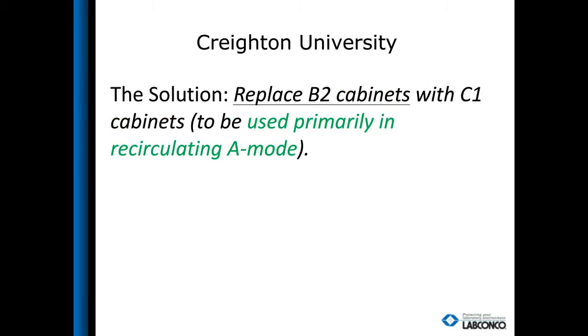So that group started by looking at LED lighting. They replaced all of their tube fluorescents with LED. They added control valves for chilled water beams and for chilled water usage within laboratories. And then they looked at the B2 biosafety cabinets. B2s get a pretty hard rap. I wouldn't say it's a bad rap, but a hard one, because they have very high exhaust requirements. They exhaust as much, if not more, than a chemical fume hood. And they require independent, separate exhaust systems per cabinet.